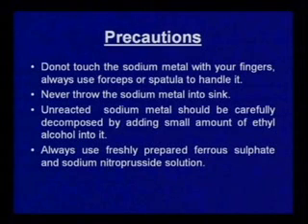Now what are the precautions which you have taken into account? Since you are using sodium metal for the first time, you have to be extra cautious. Number one, do not touch the sodium metal with your fingers. Always use forceps or a spatula to handle it. Never throw the sodium metal into the sink.